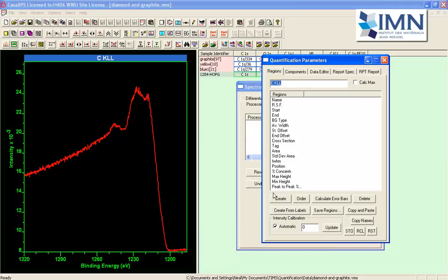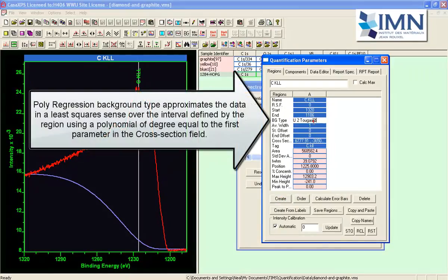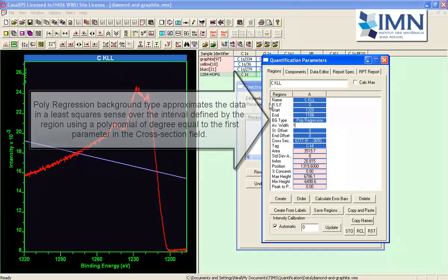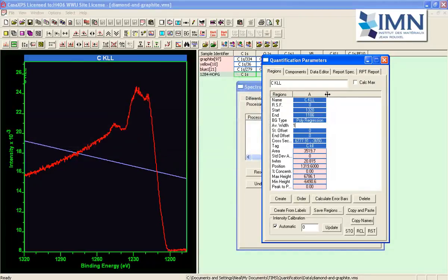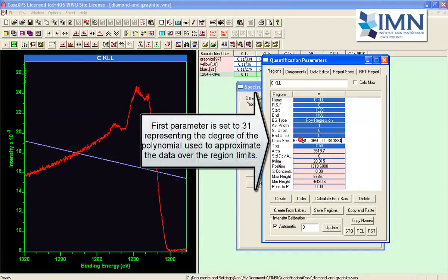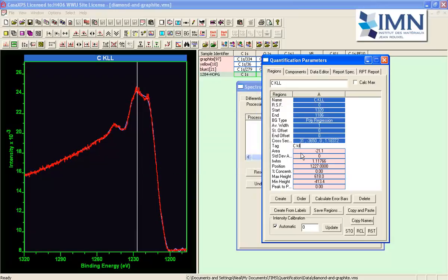We can create a background type which will use a polynomial of higher degree. So it is the polynomial regression type and it uses the cross section parameters or at least it uses the first one to provide a degree for the polynomial that will be used to fit the data.